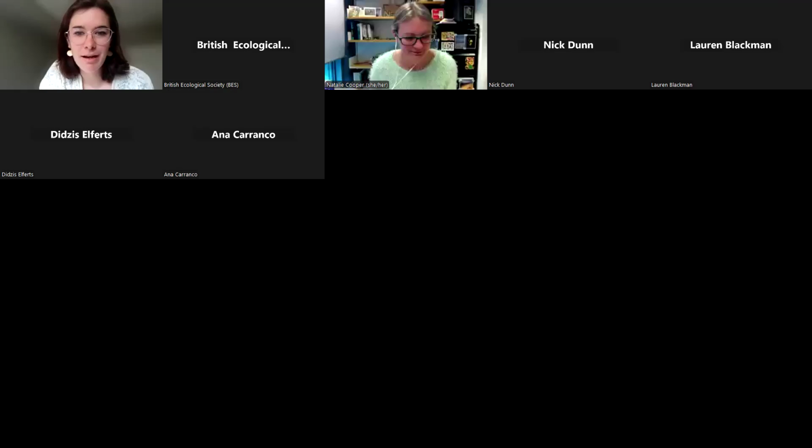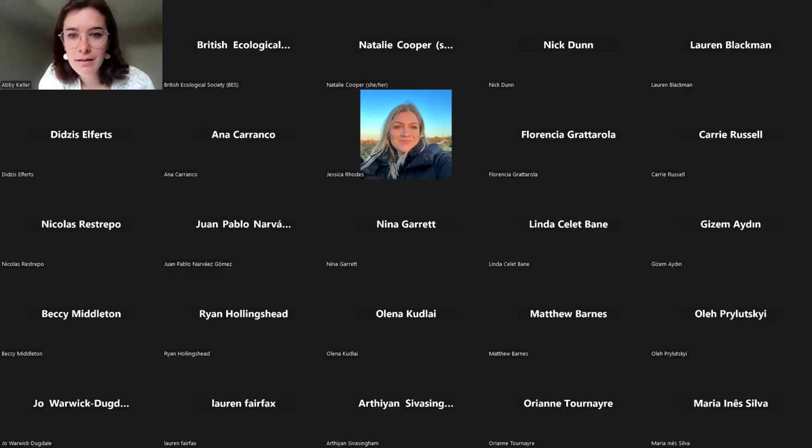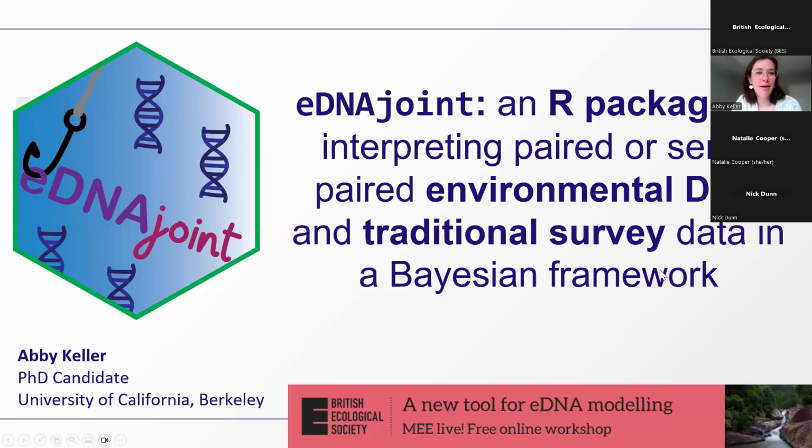I'll just share my screen. Hopefully everybody's seeing this. Like Natalie mentioned, I'm Abby Keller. I'm a PhD candidate from UC Berkeley, and today I'll be sharing a little bit about an R package I developed called eDNA Joint, which will hopefully be a useful new tool for modeling environmental DNA data.